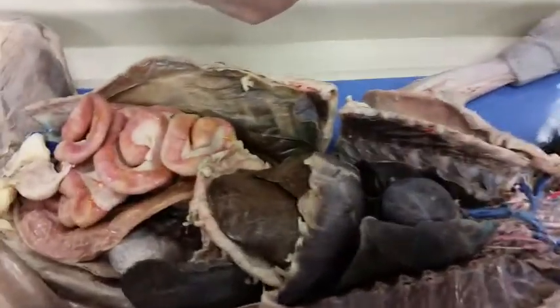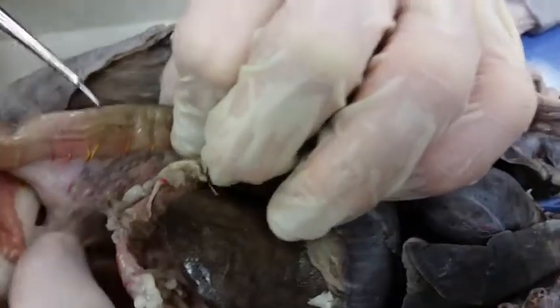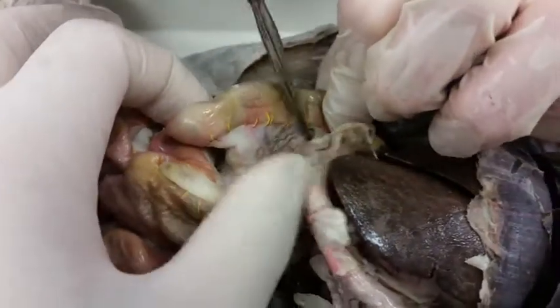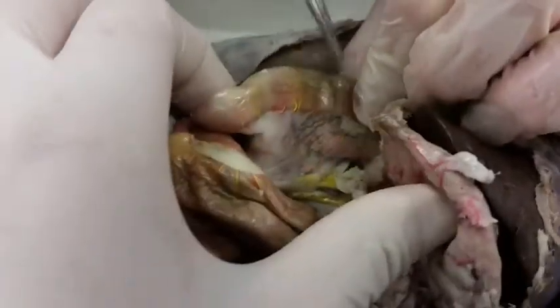Okay. So, coming off the stomach here, and let's see here, the stomach, let me find here, okay, stomach's right here. So coming off stomach, this is divided into two different areas. On the outside here we have the duodenum, on the inside is the pancreas. So the duodenum's the really solid part, the pancreas looks almost like you could just tear through it.